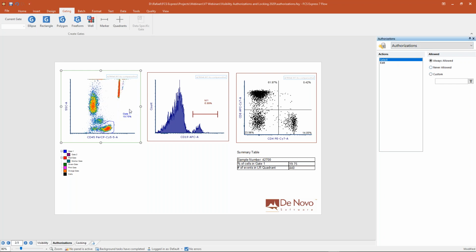And you can see now that I am no longer able to do anything but edit the properties of this specific text box. I can't grab it and move it around like I'm trying to do here. We're prevented from using those select actions. And if I go ahead and reallow that, now I can reposition that gate one more time. So I get that red border appearing here.